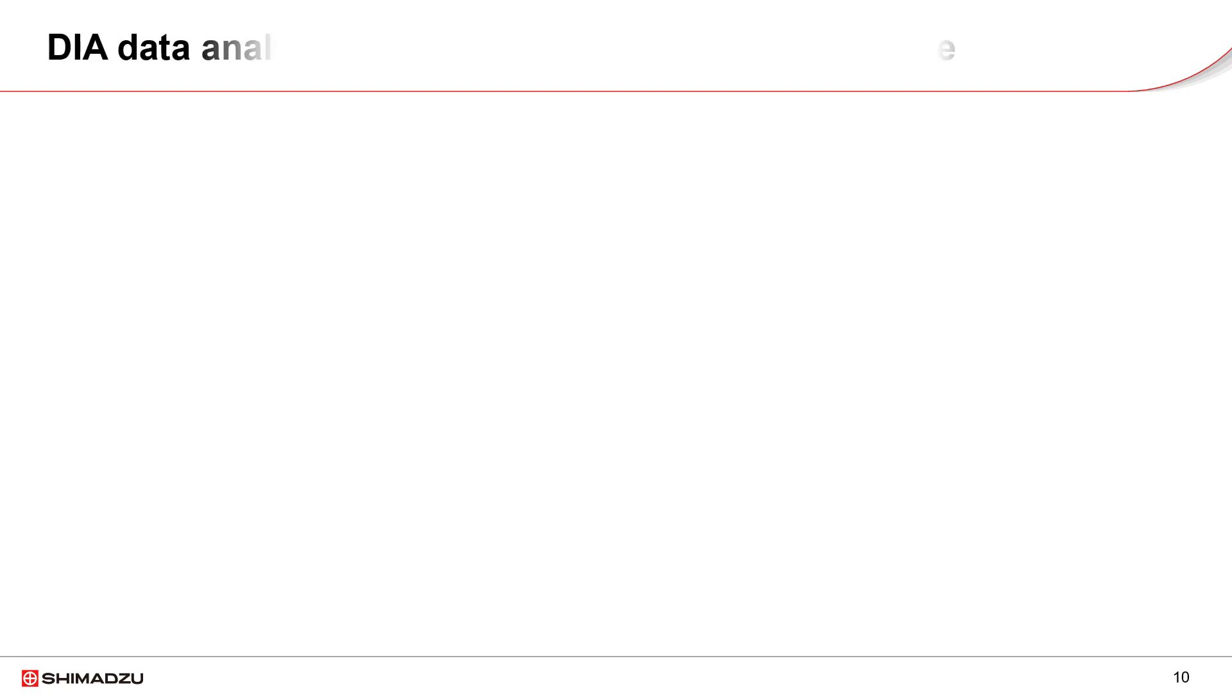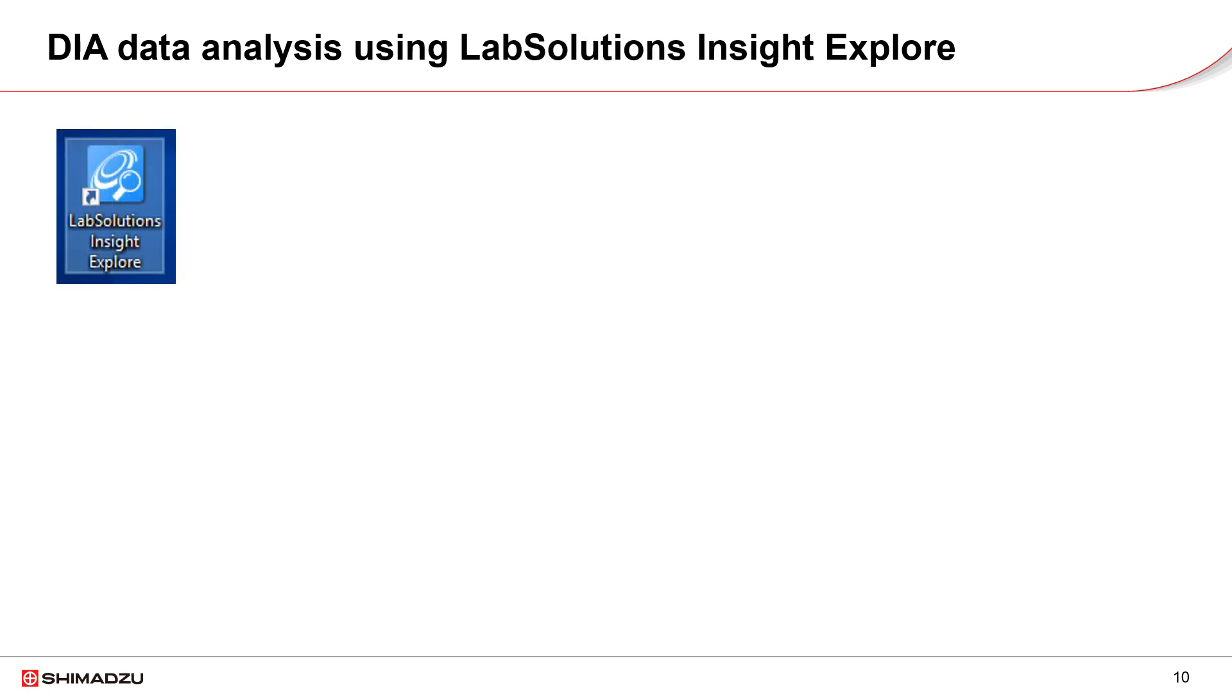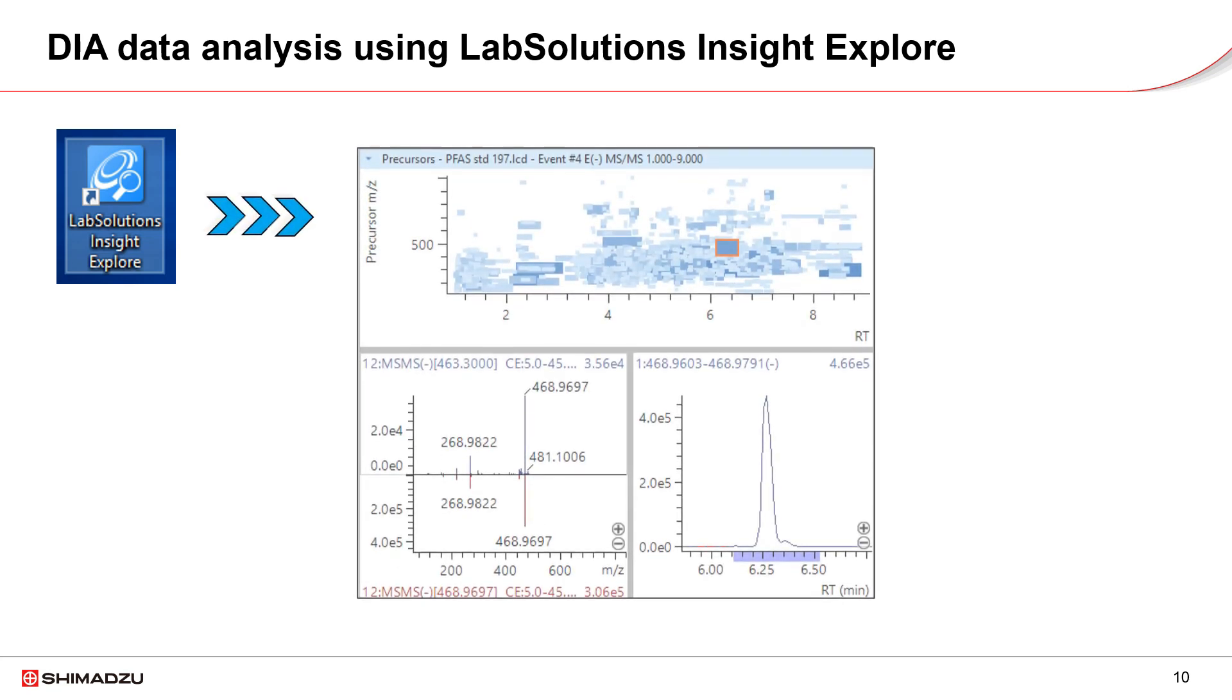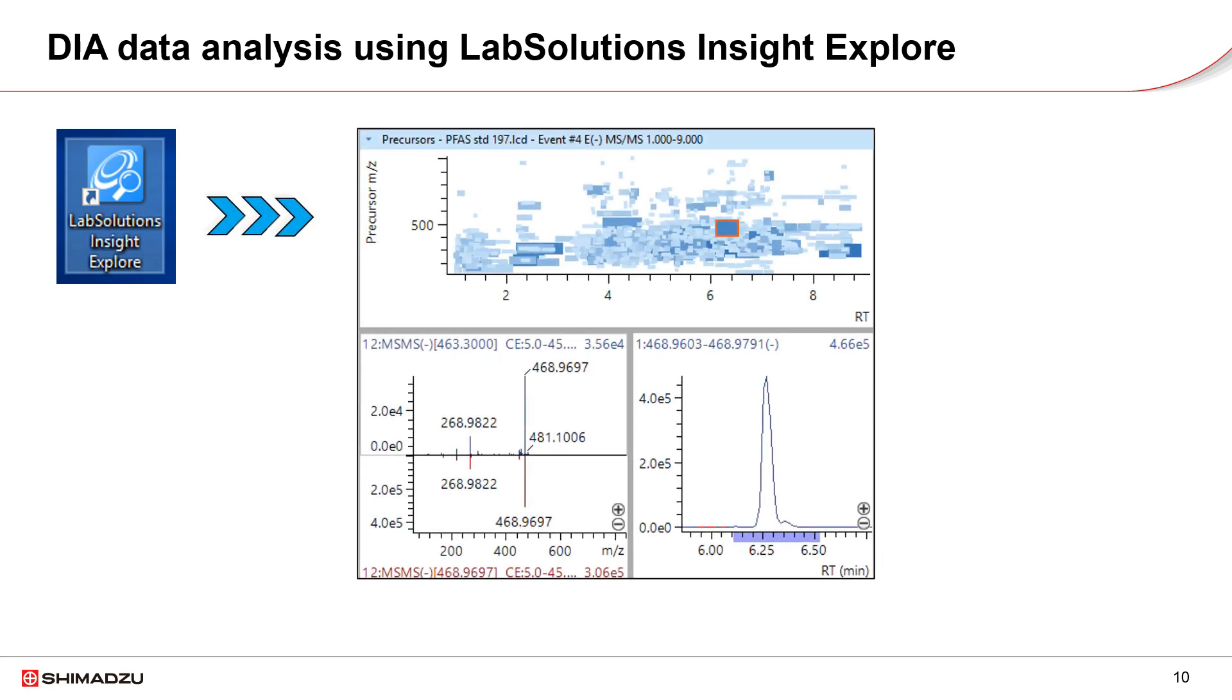DIA data analysis is performed by the LabSolutions Insight Explore software. First, DIA data is deconvoluted to obtain precursors in MS-MS spectra. A precursor pane displays all the precursors deconvoluted. Click on any precursor. The XIC and MS-MS spectrum are displayed in the bottom of the screen.